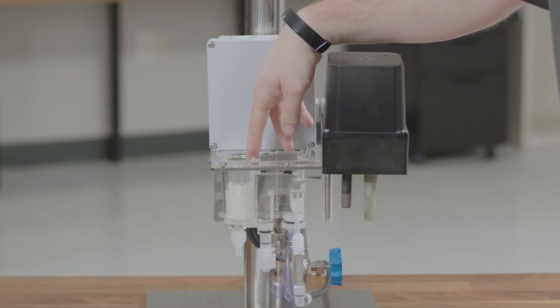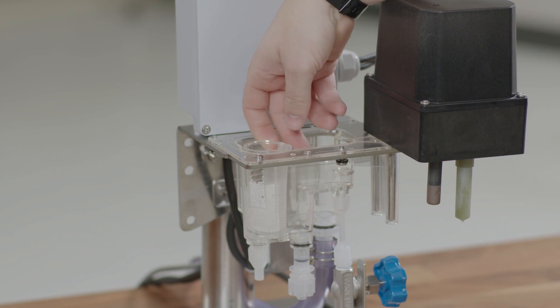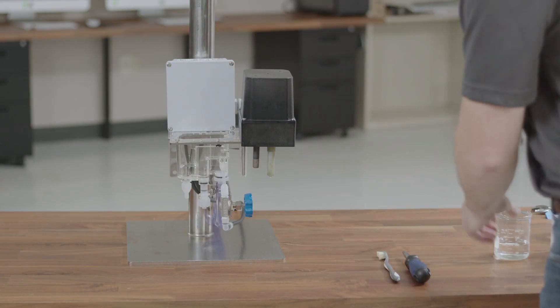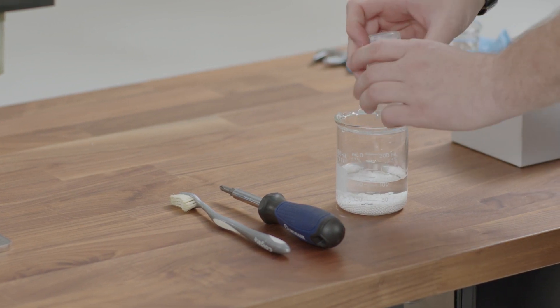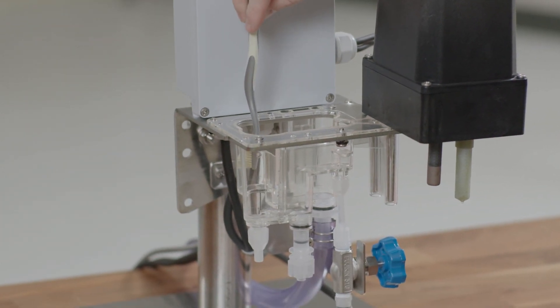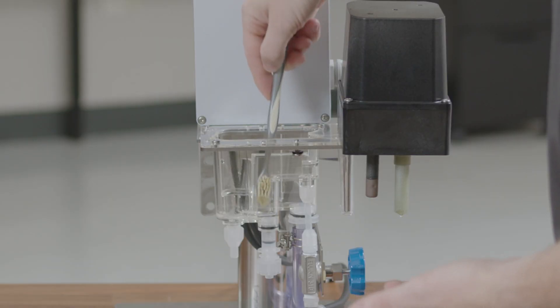The first thing we want to do is remove the bead container. You can do this by grabbing onto the small rubber piece next to the bead basket and pulling straight up — this will remove the entire bead basket. With the bead basket removed, you can place your beads into a separate container for cleaning or disposal. Now that the flow cell is empty, you can take a soft toothbrush and some mild detergent or, in extreme cases, some hydrochloric acid and begin to rinse and scrub the flow cell.